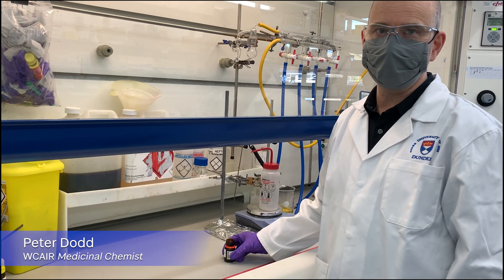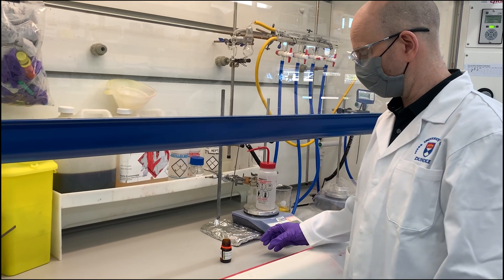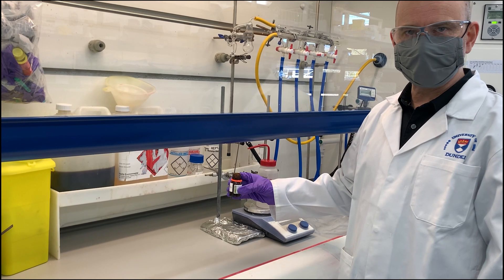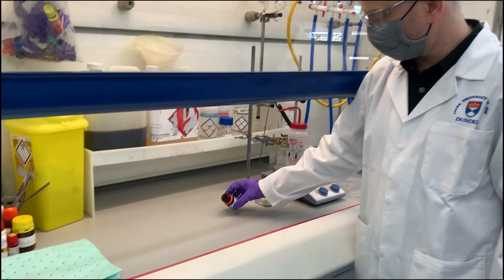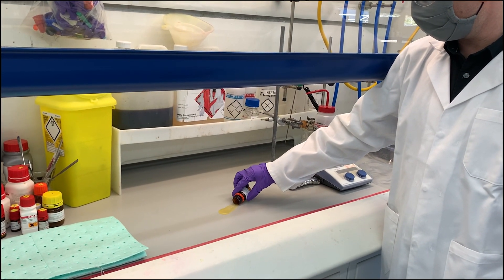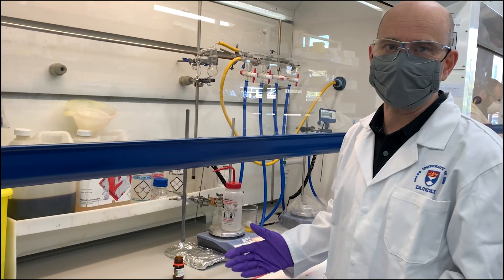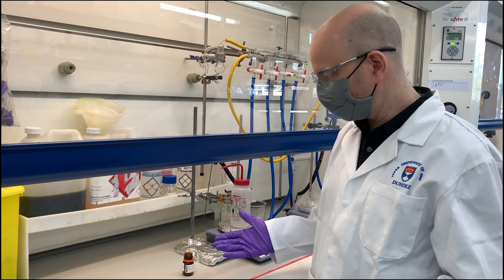I'm going to show you how to clean up a small spill inside a fume hood. I have a small prop spillage material here which I'm just going to pour directly onto the fume hood floor. It's quite a small amount and it should be manageable by anybody really.